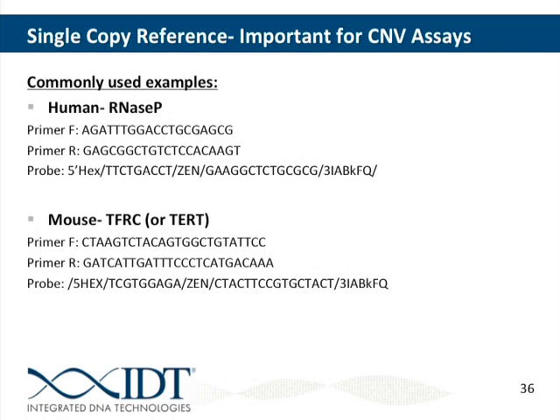In fact, NCBI updates the SNP database constantly and very frequently, and I think they're up to 9 million SNPs for human, and that's up from like 6 million just several months ago. So it's constantly being updated, and so there kind of is an expiration date in terms of an assay. An assay that was successful 10 years ago may work okay, but why hedge your bets? You might as well start with something that you can control and know that you can optimize.